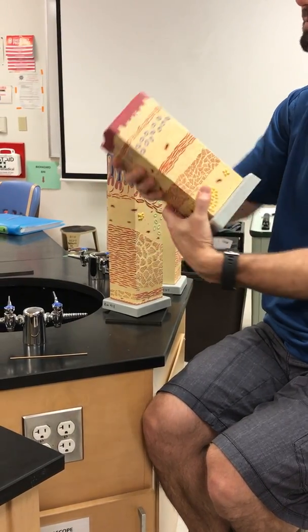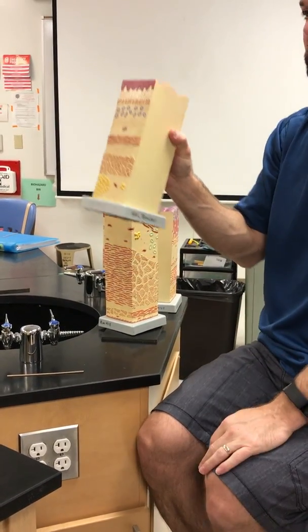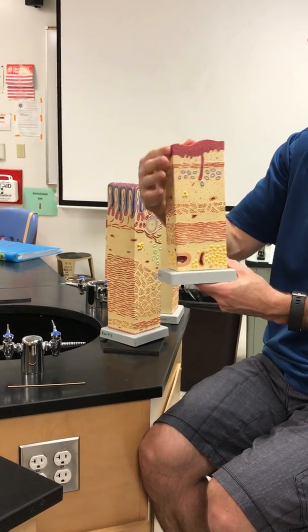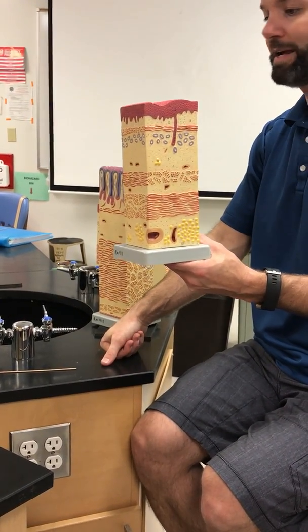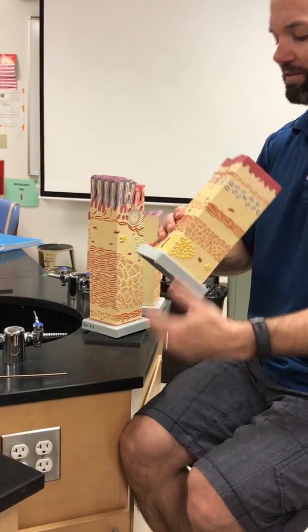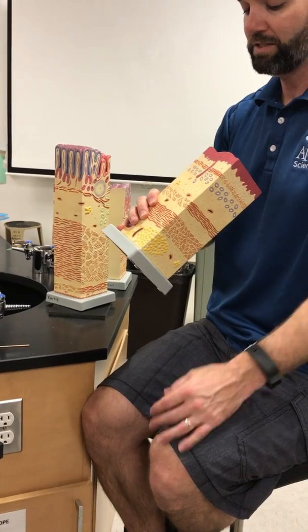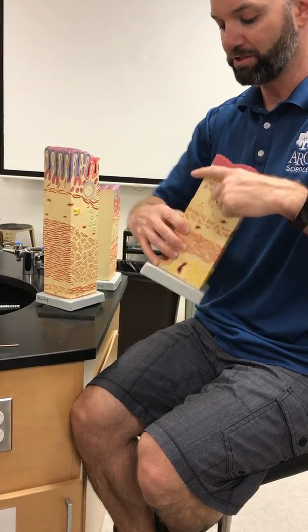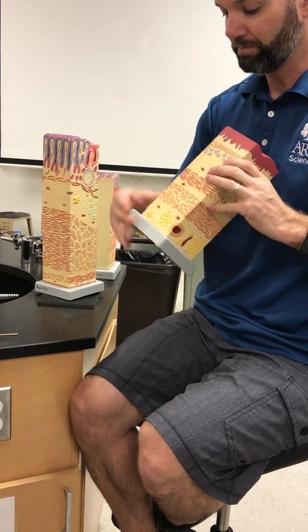So it's flat, but if you look from the side, it's a stratified epithelium, stratified squamous. So it must be esophagus. It can't be stomach or intestines. And then what else do you expect to find in the esophagus? Esophageal glands. So there's a duct, and these are esophageal glands, the blue.